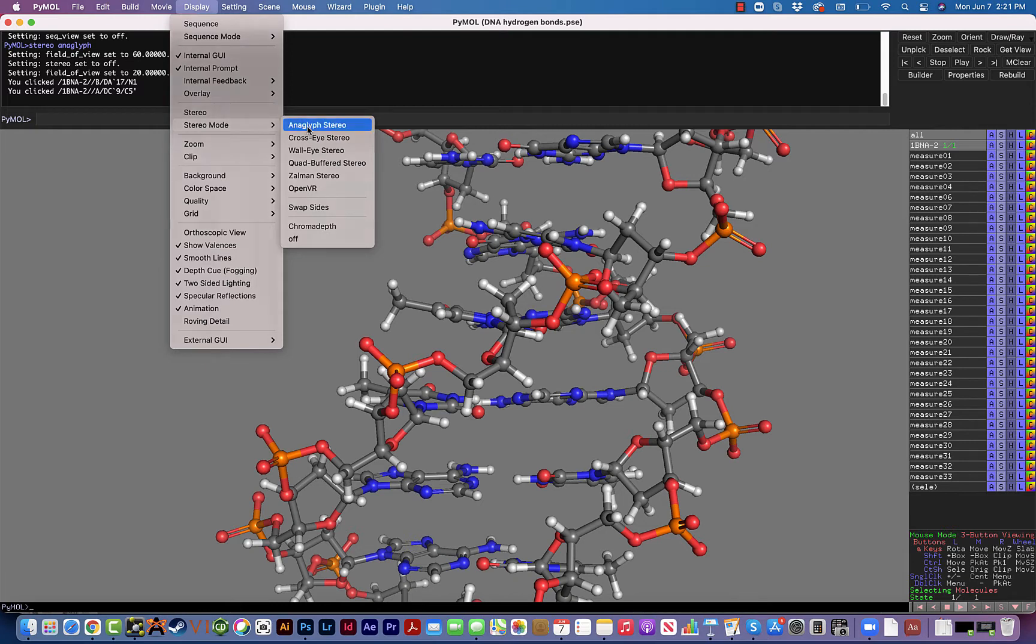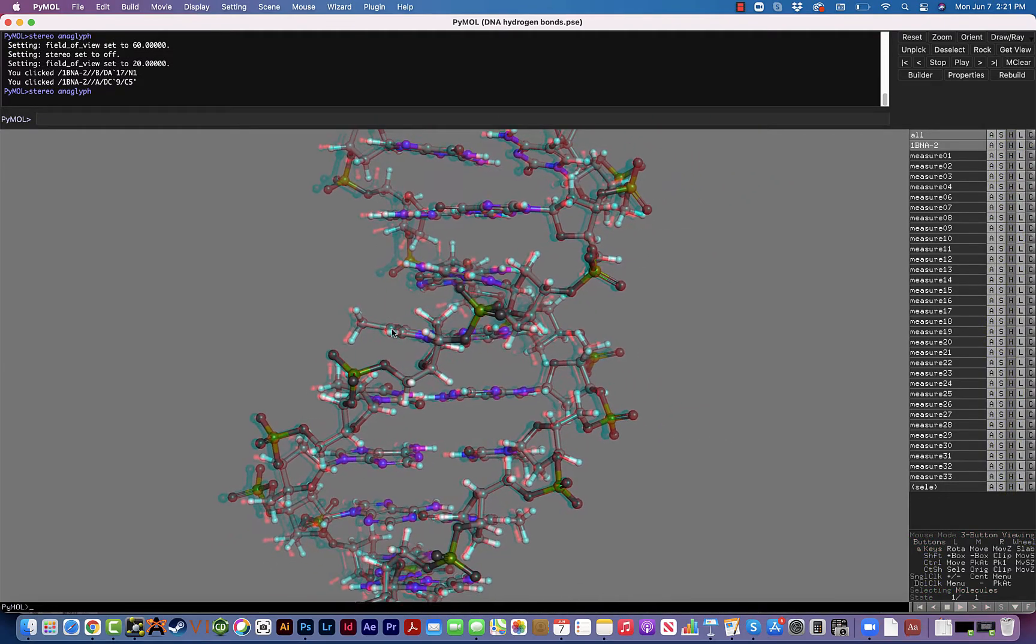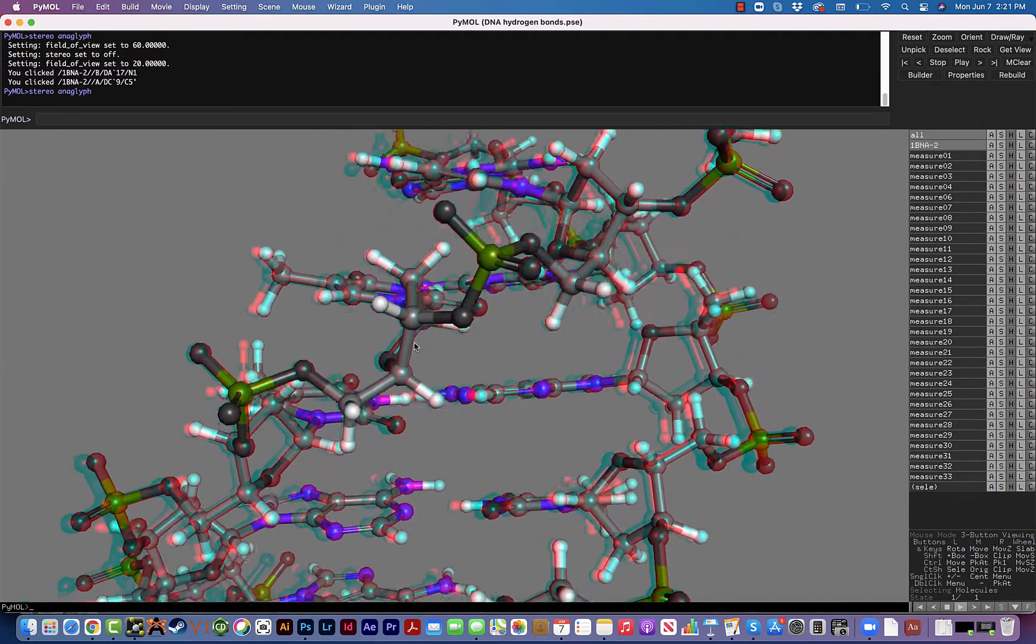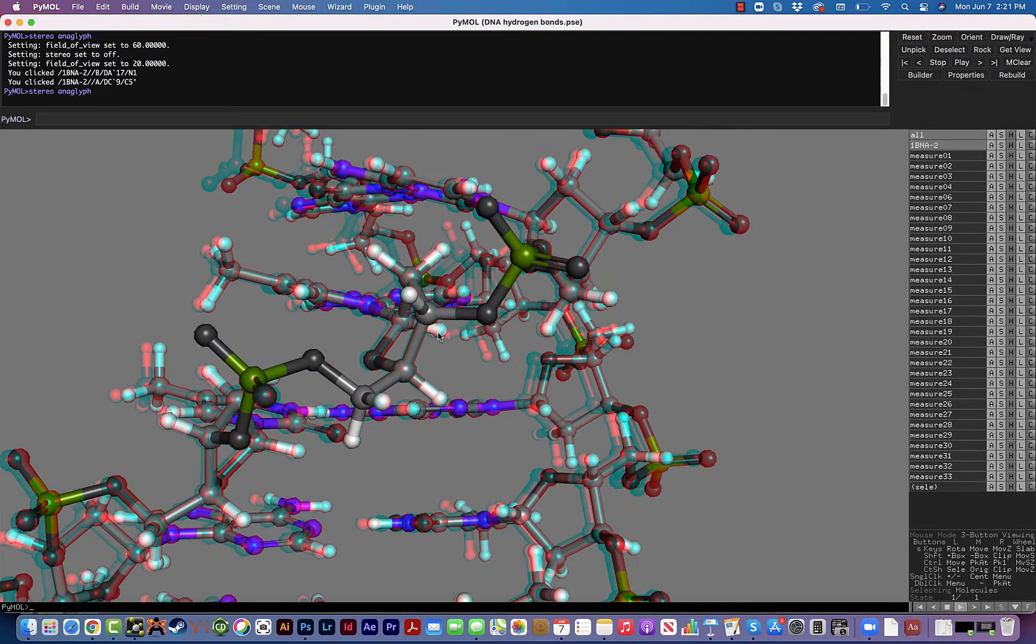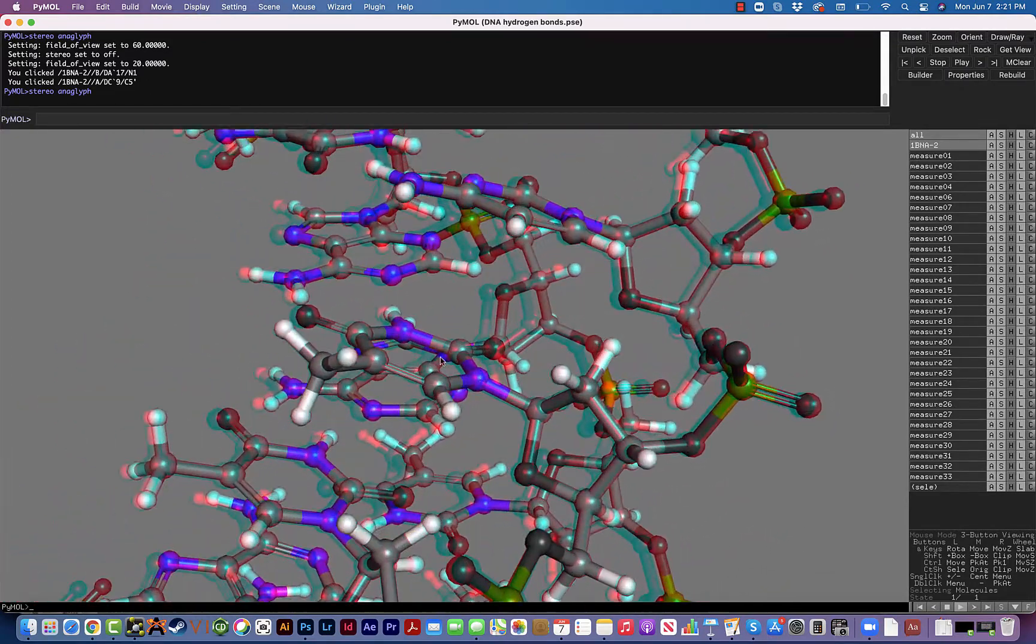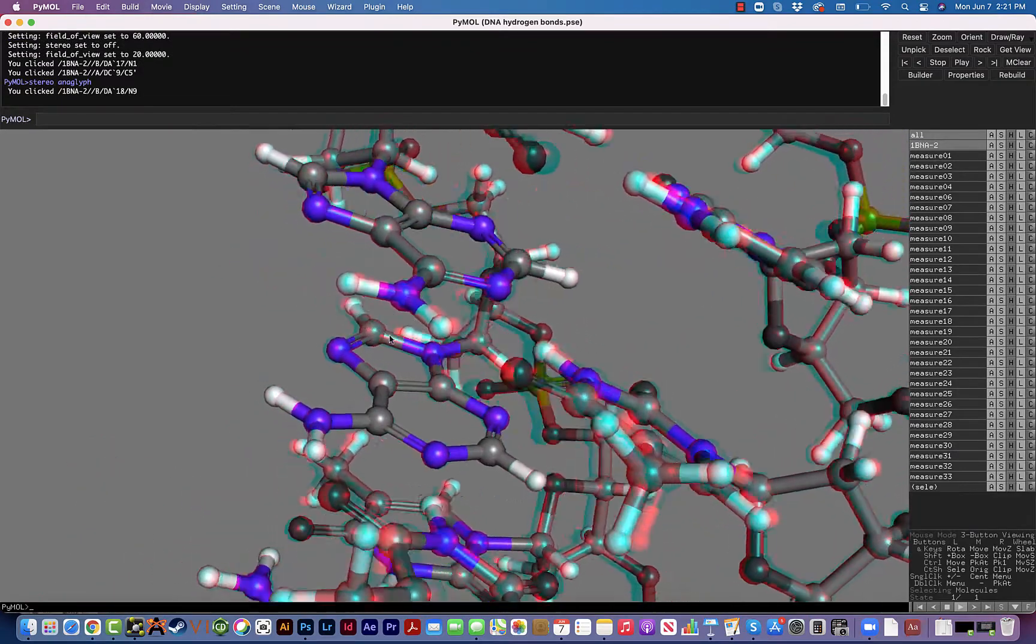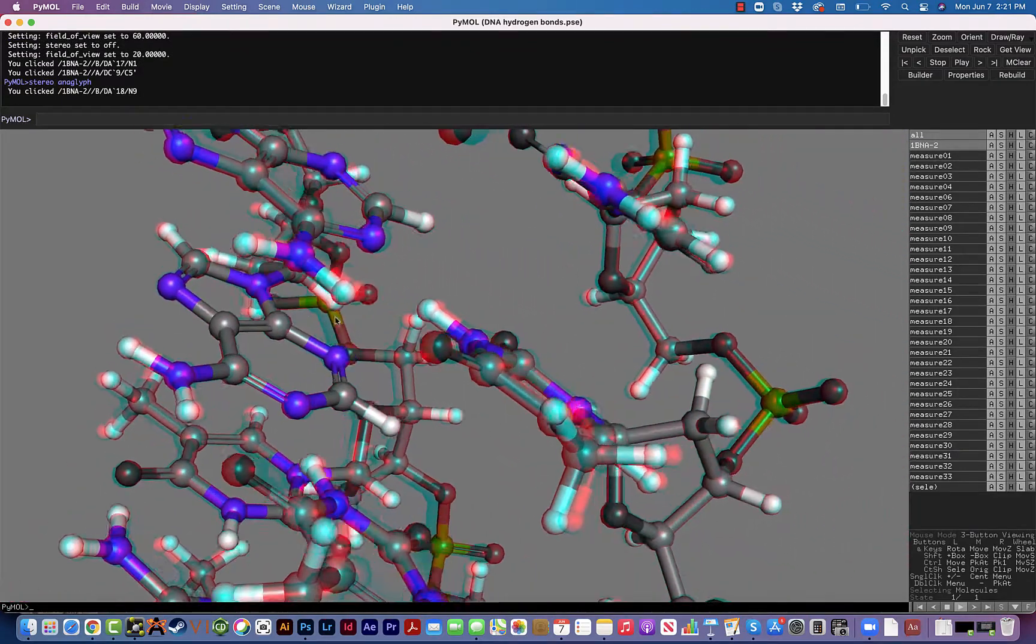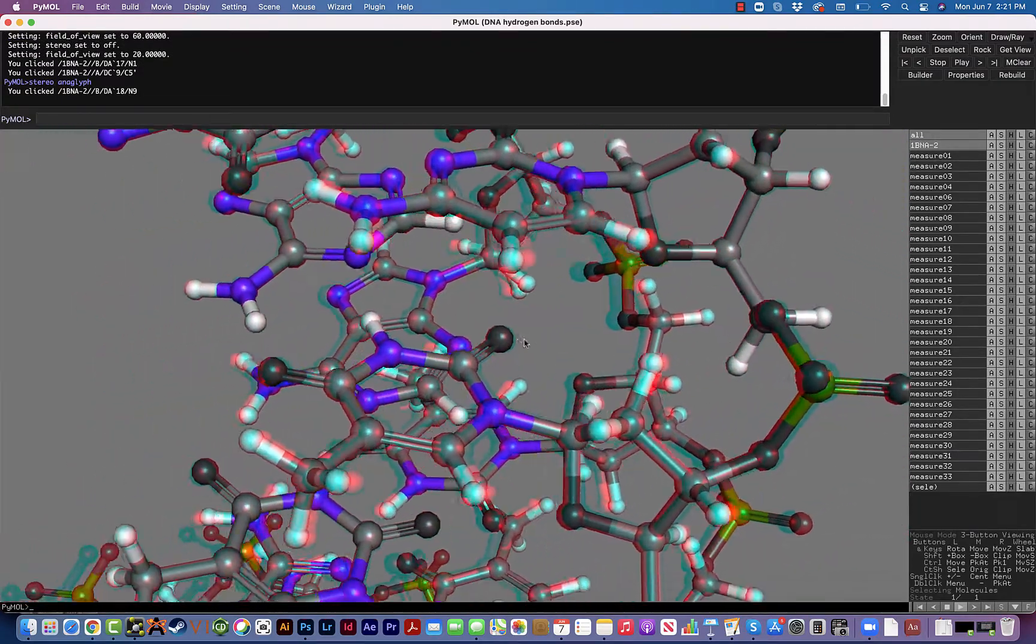So turn on the stereo view and you're going to notice that's going to change the colors. It doesn't look very impressive to someone who doesn't wear the glasses, but if you're wearing the glasses it really does look amazing and you can really see that parts of the molecule are jumping out at the screen.